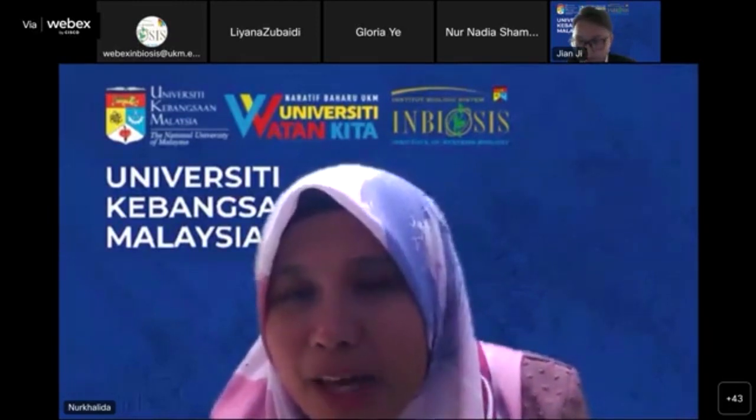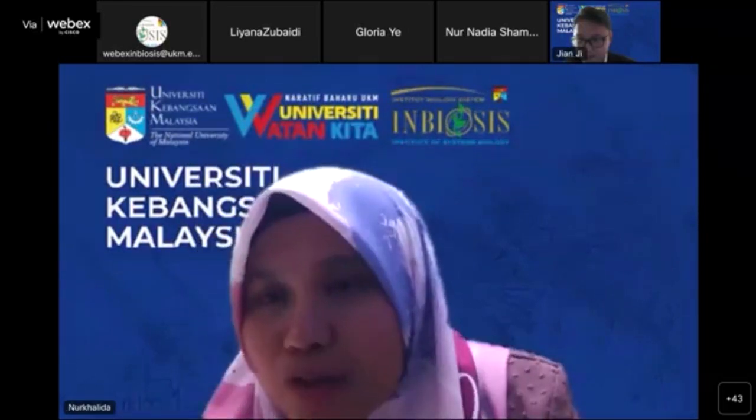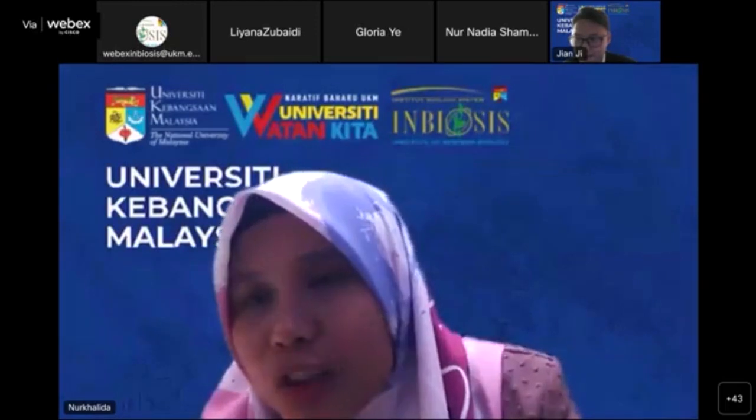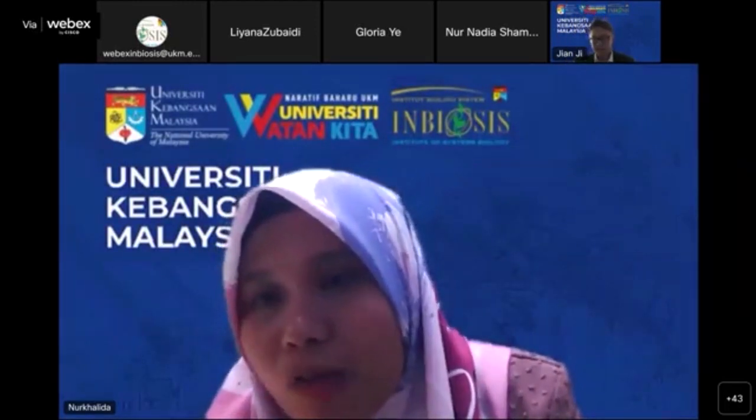All right. We have a question from Dr. Kamarul Azlan. He has 3 questions. The first question is: is signal-to-noise ratio important for GCMS deconvolution?